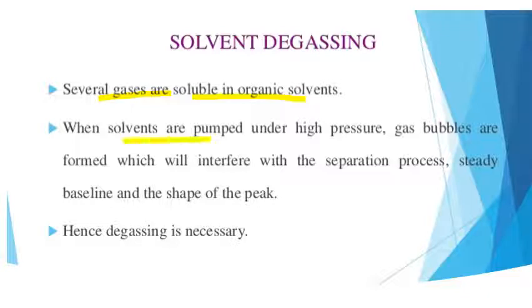When these solvents are pumped under high pressure in HPLC, they form gas bubbles, which interfere with the separation process. It affects the shape of the peak and the steady baseline. That's why the whole analysis is disturbed by these gas bubbles.